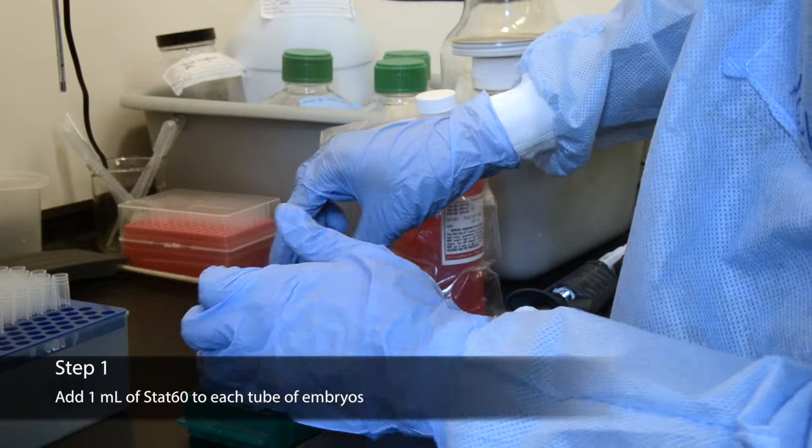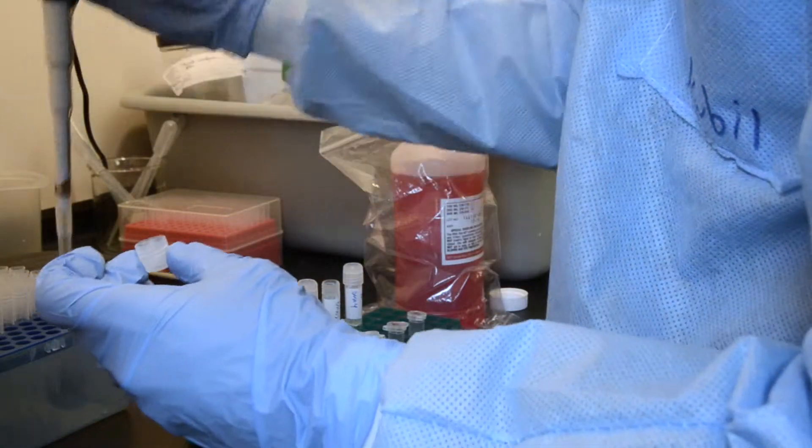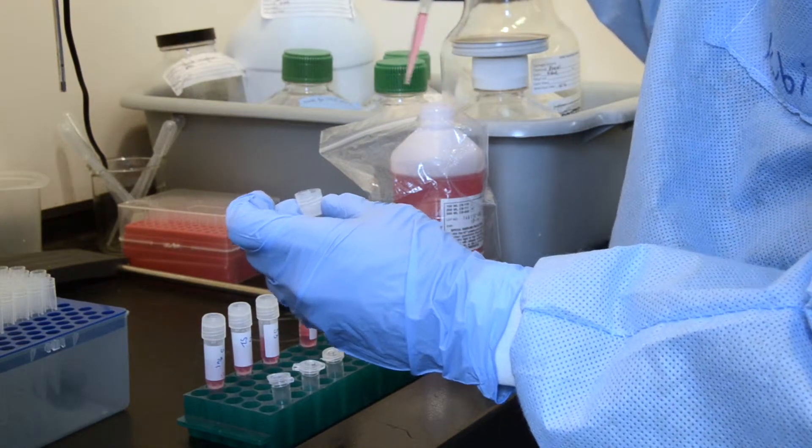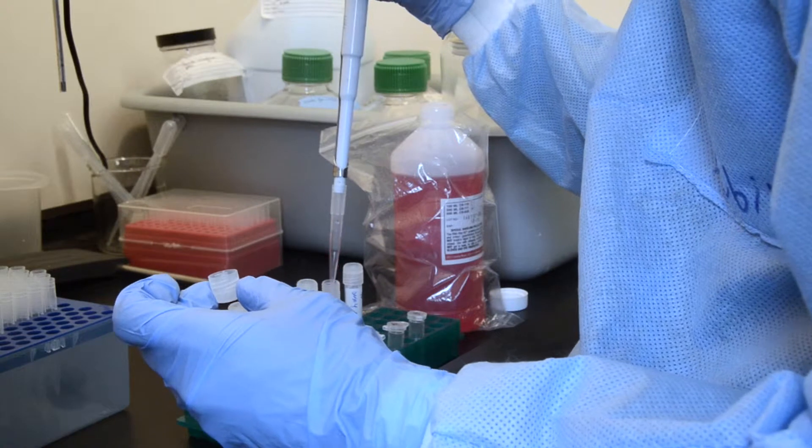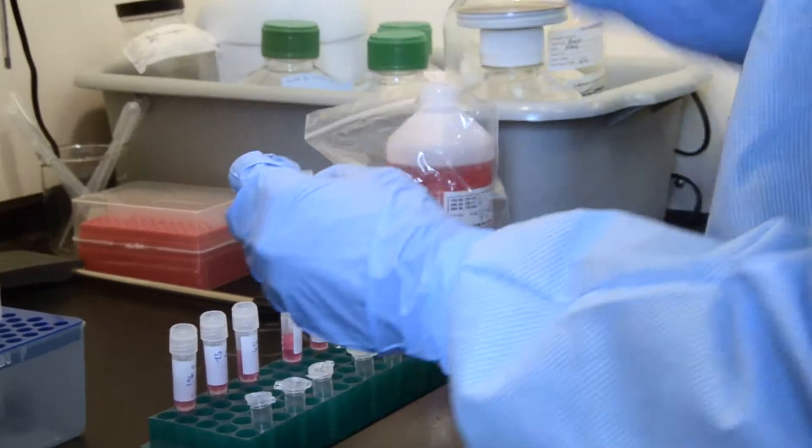In the initial step of the RNA isolation protocol, embryos are homogenized in STAT60. One milliliter of STAT60 should be added into each tube of embryos. The RNA STAT60 contains phenol. It can be fatal. When handling the RNA STAT60, always wear gloves and a lab coat and operate in the hood.